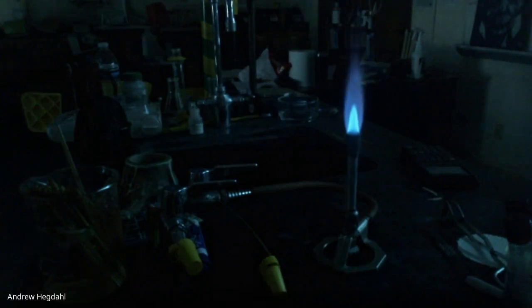You get a different one for each of the flames, right? Yes. Yeah, we grab a fresh splint every time. Just grab one at a time. Keep it wet. Just one at a time.